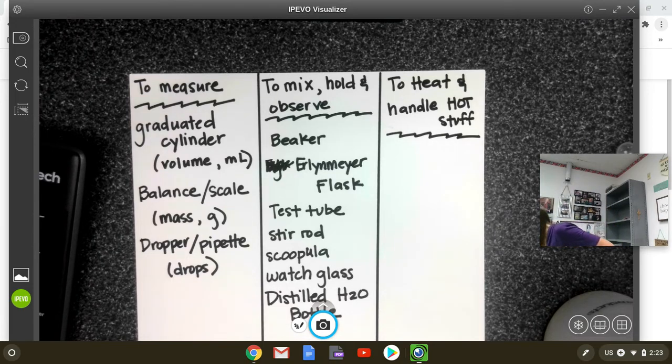So I have 3 different pieces. Actually, I'm missing one of them. Oh, let's see here. I'll have to go track those down. I'm missing my beaker tongs. Molly, can you look for another pair of tongs for me that look like this, but they're kind of round? I think I set them back over there somewhere. They're over back there maybe.